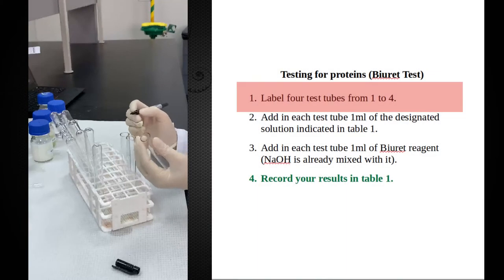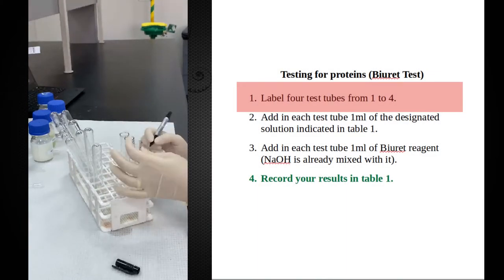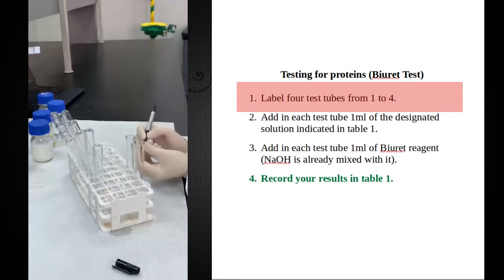Take the appropriate amount of test tubes. Here I will test three, so you label them one, two, three.